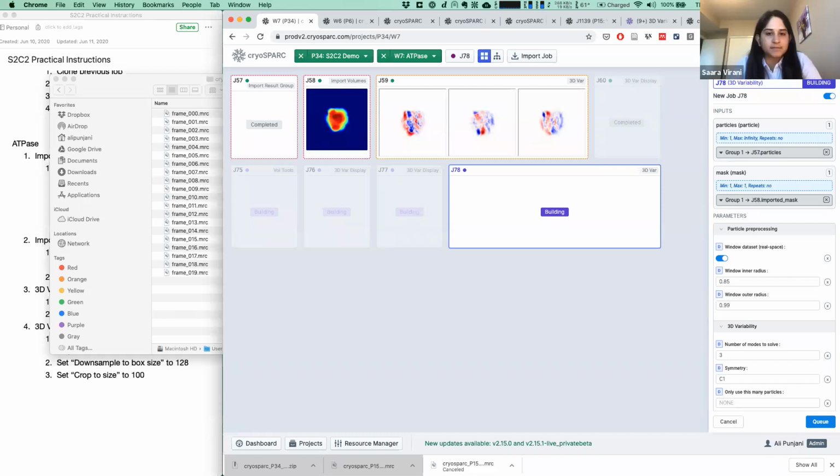About masks specifically, what actually makes a volume a mask? Nothing in particular. Masks are also stored in MRC files on disk. The main thing is that a mask only contains values between 0 and 1 typically, and is treated differently when we're actually doing processing. You wouldn't use an electron density as a mask or vice versa. So CryoSPARC thinks of them as different types of objects. Under the hood, they're actually the same. When you're importing MRC files, volumes, you need to tell the import job whether you're importing a mask or a volume.